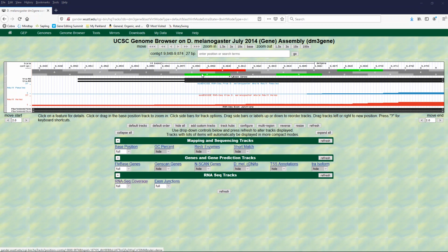So that means in order to figure out what the amino acid sequence for this particular gene is going to be, we want to look at the bottom of these three reading frames. So M, methionine, is the first amino acid. The next one, which is coded for by A, that's going to give us the amino acid K, which is lysine, and then so on. Notice we have another ATG, which also codes for methionine. We have another methionine showing up in the third amino acid position.